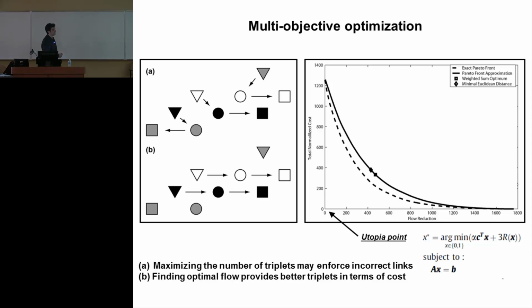So you have these different particles, different frames. You are saying if they are linked to the next particle or not, but it's not looking at whether they are correct or incorrect, or are you also looking at the correct connections? So we have no ground truth in these links, so we don't know if they're correct or not. But they have to be connected to something. Yes. And if somebody is not connected, then the flow is reduced.